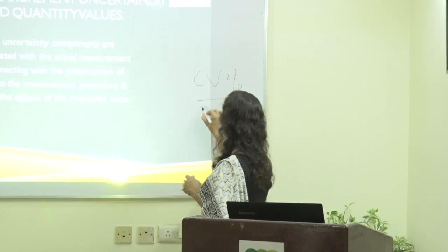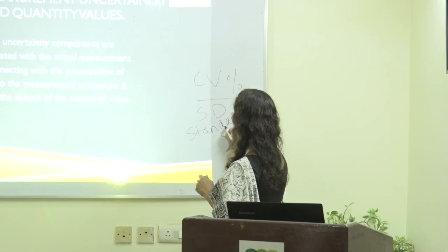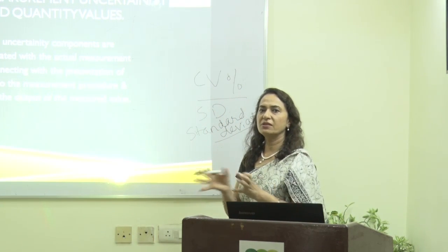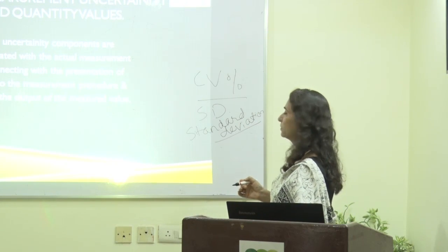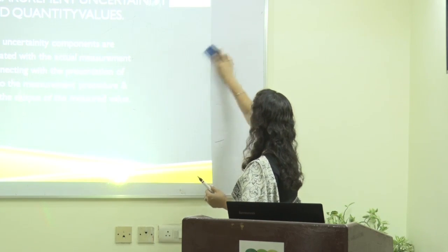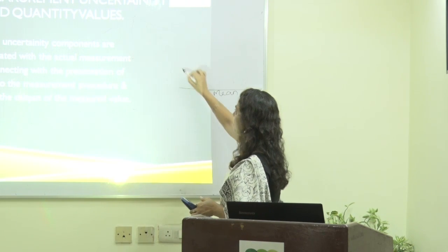What is standard deviation? I am not going into calculation. I am just trying to make you understand in a layman's language. How close to mean? When you plot a LJ chart, there is a mean.